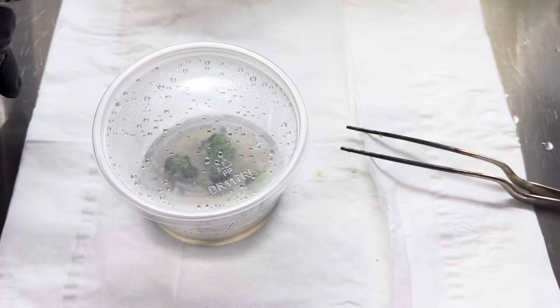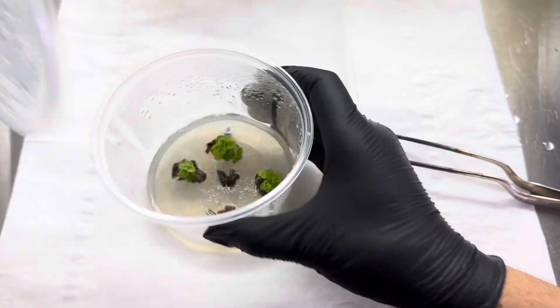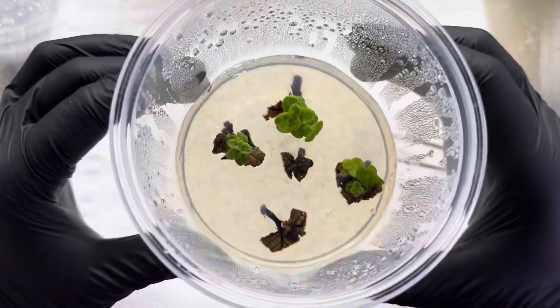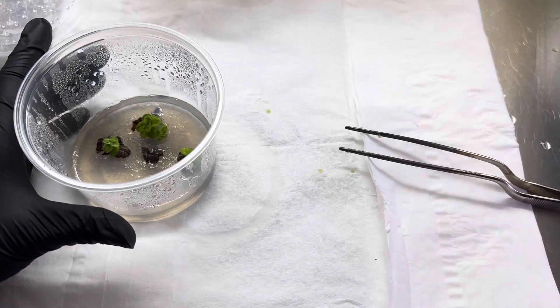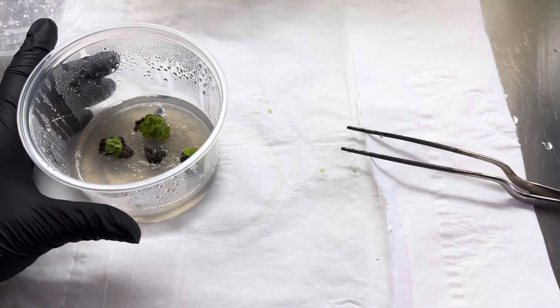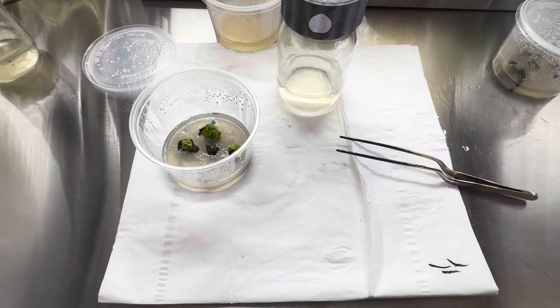All right, so something a little different. We're going to take these coleus — they're doing really well — and then we're going to use one of the biocouplers from Lant Cell Technology.